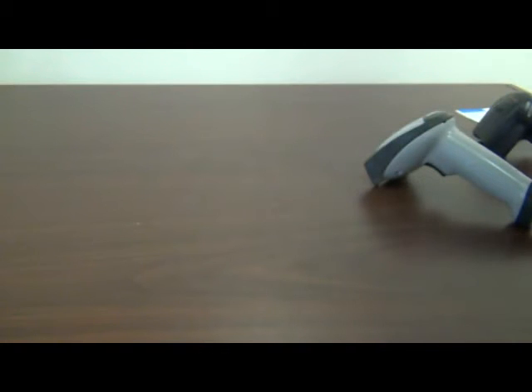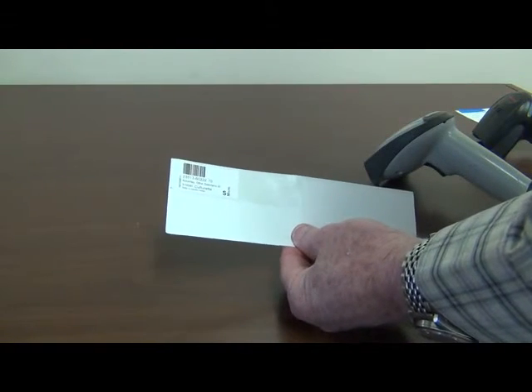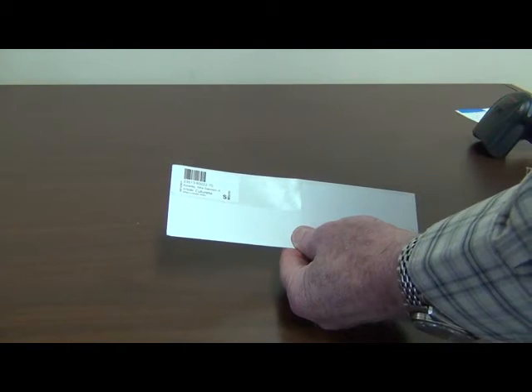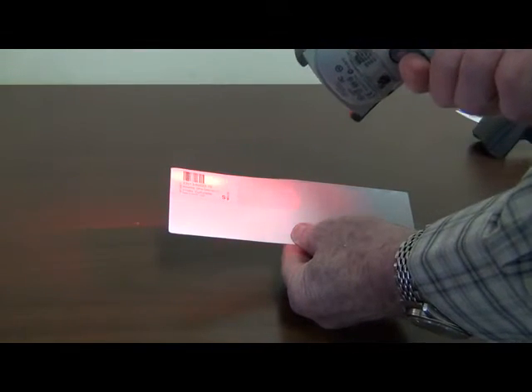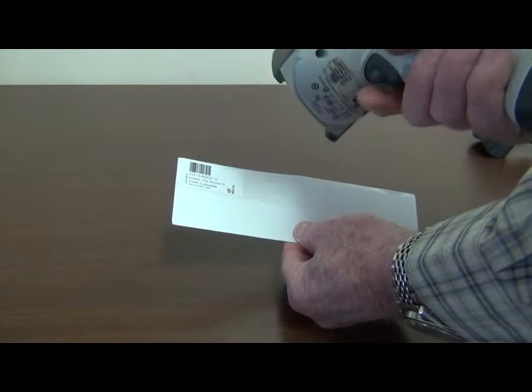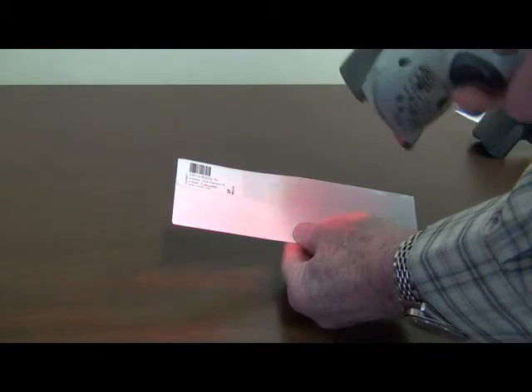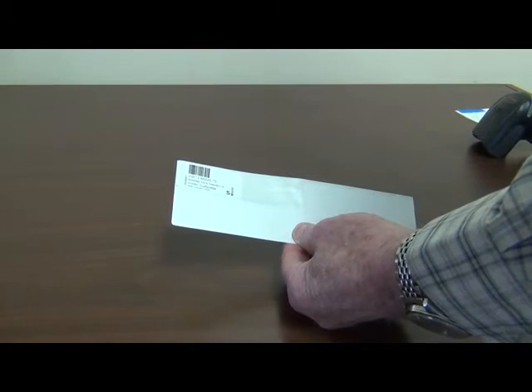So let me take a look at a different barcode. This is a very small barcode, found on a lab sample. And you will see that it is unlike the other one. It has some difficulty scanning. I know the characteristics of this one are that it's too small. It's a very small X dimension. The narrow bars are too small for this scanner to see. Also, it's a bad barcode. It's an F, a grade 0.